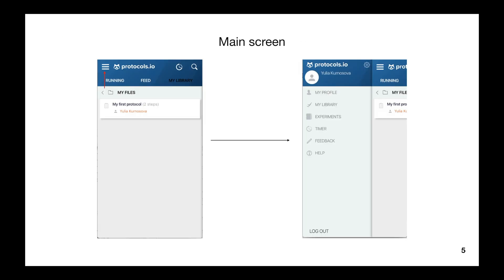After login, you will be taken to the main screen. At the top left corner, you see a button which opens the side menu. The side menu can also be opened by swiping from the left side to the right edge of the screen. The side menu allows you to navigate through different modules of the app. You can leave feedback, use the timers tool, check your profile, or change your personal file.